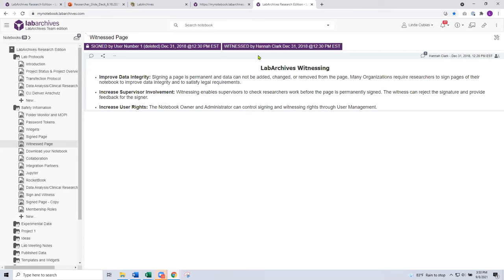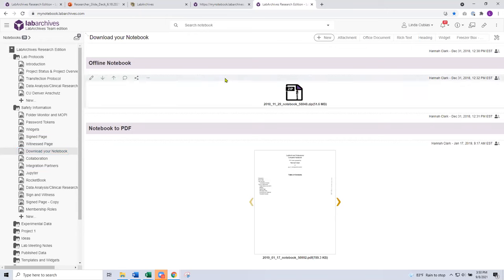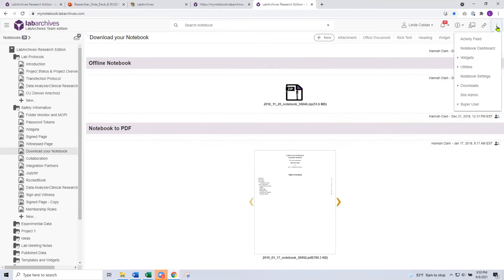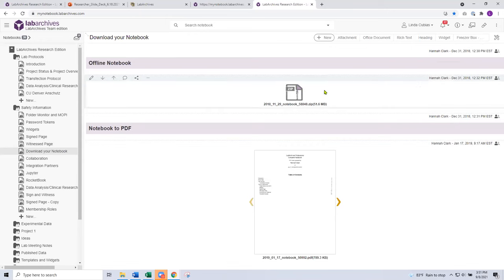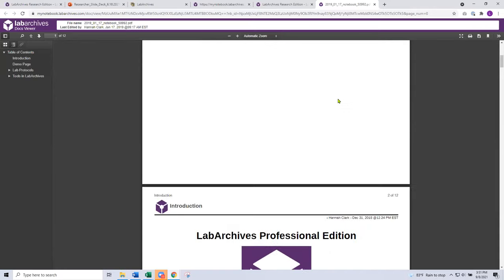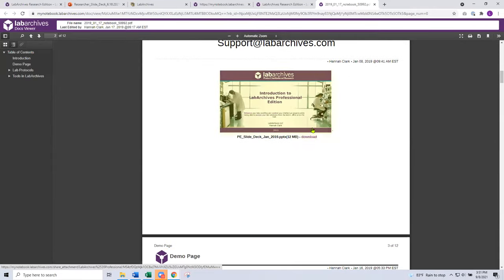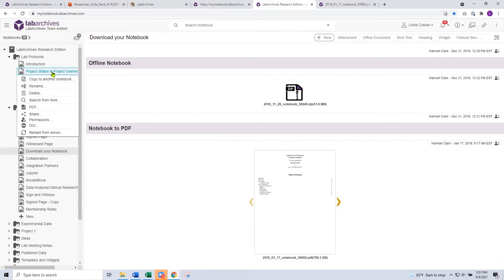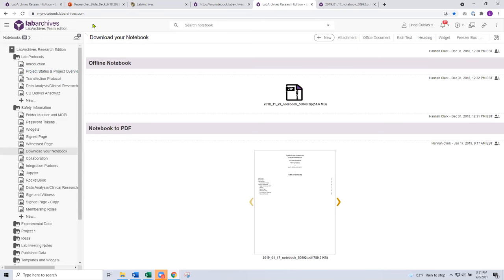The final thing I want to cover is your downloading options. You can download your notebook in two different ways — as an offline zip file or as a PDF. These features are available from the skewer icon under utilities, where you can choose 'Offline Notebook' or 'Notebook to PDF.' The zip file option gives you your entire notebook available offline, including every attachment. The PDF option is a little different — instead of every attachment, you get a link to download your attachments separately. As a reminder, you can right-click on a section of a notebook — the page level, entry level, or folder level — to download using the PDF feature.